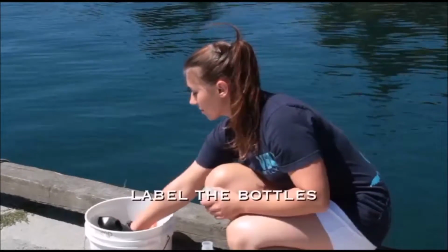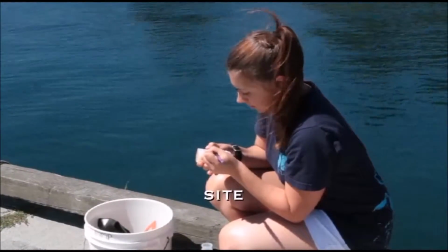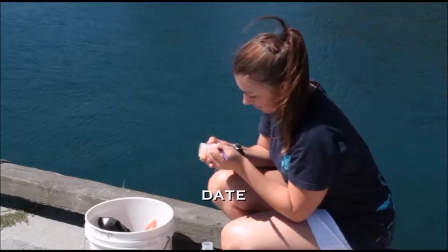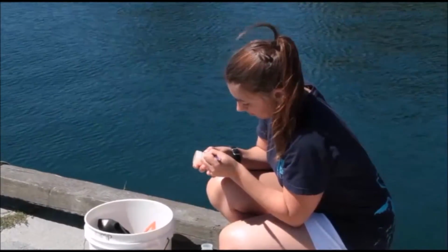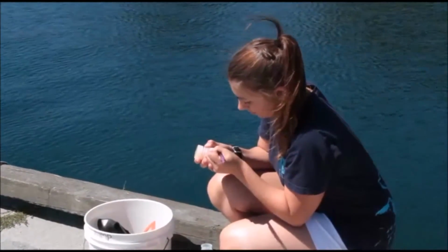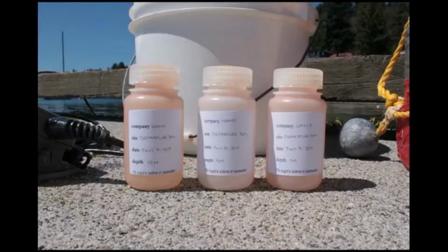So now we'll run through taking a discrete or bottle sample. First, label your bottles. This is easier before than after. Writing on wet labels is no fun. Write down the site where you're taking the sample from, the date, and the depth. More info than less is better. What seems obvious to you now may not later. There you go, 3 nice labeled bottles ready for the samples.